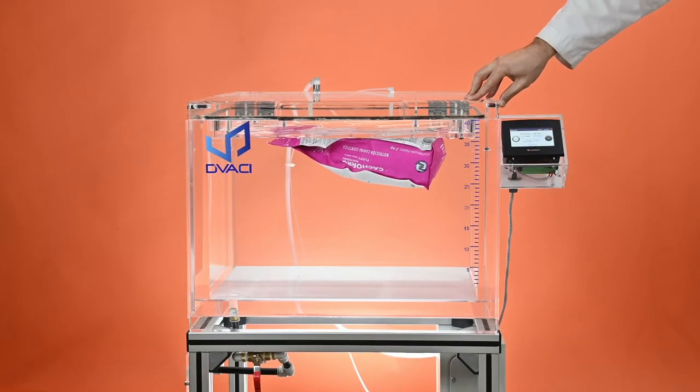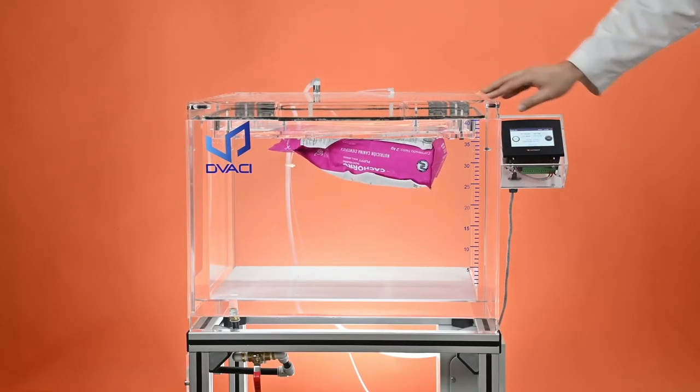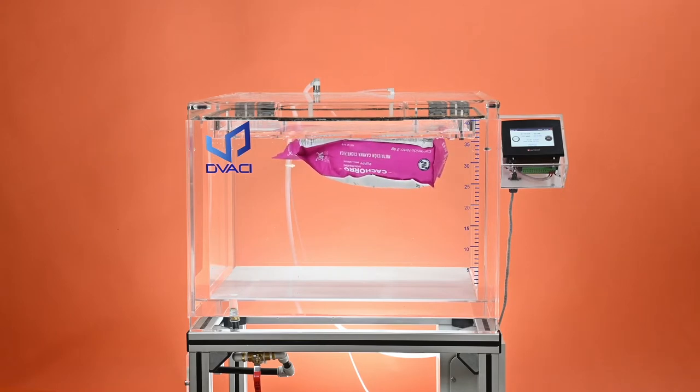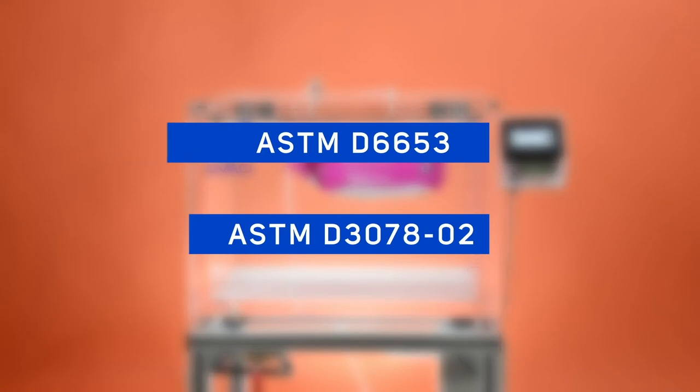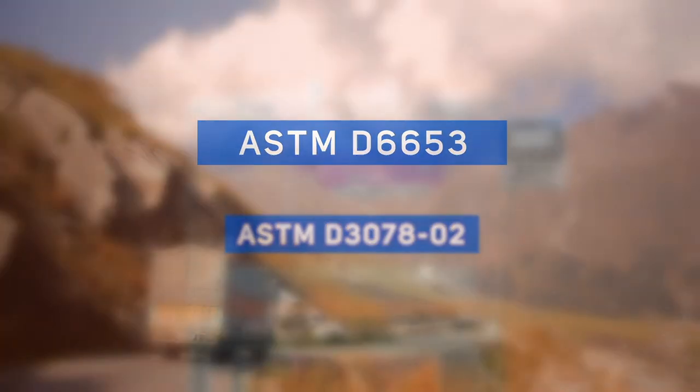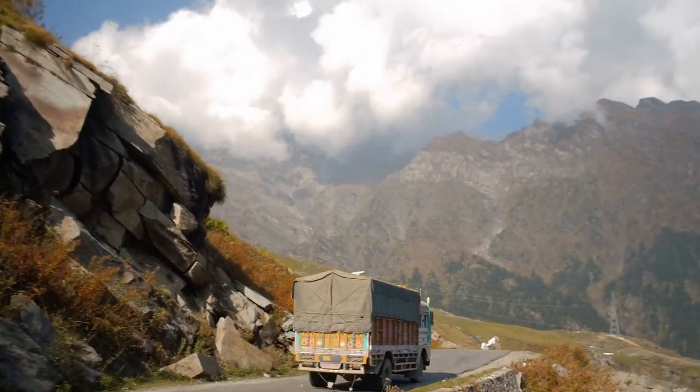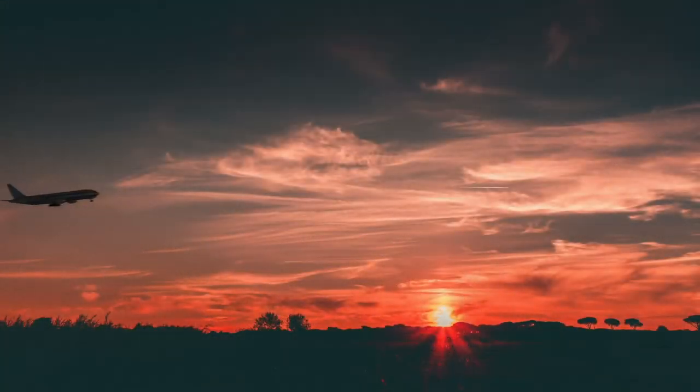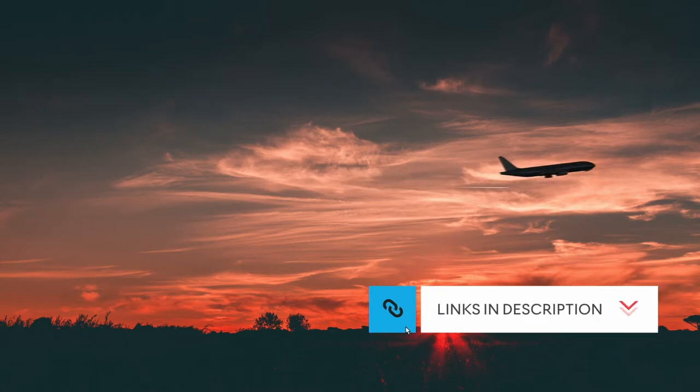Next up, we will explain what to do if there are any leaks. But first, we would like to highlight that our CDV can help you to perform different test methods, such as the ASTM D6653, to simulate your product behavior during ground transportation over high mountain passes, or traveling in an aircraft. Check out our video for detailed instructions on how to perform these tests.